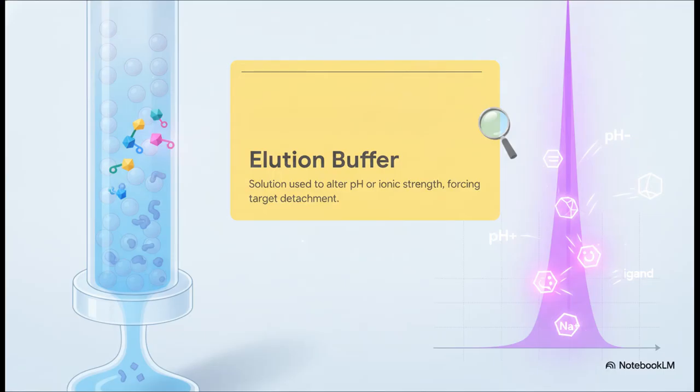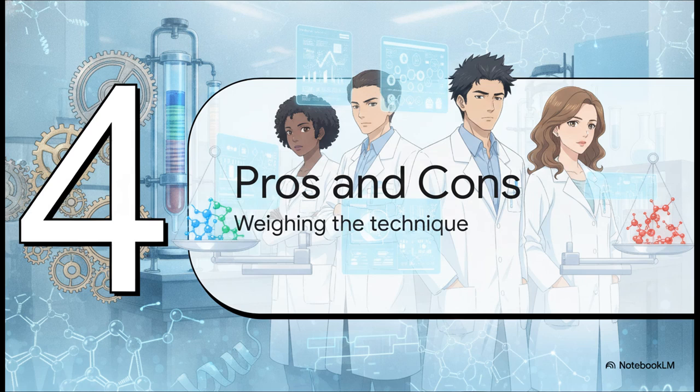To get that beautiful, sharp spike, we have to use an elution buffer. Because that biological interaction is so strong, once the impurities are gone, we actually have to chemically break that lock-in-key bond. We do this by changing the pH, altering the ionic strength, or sometimes adding a competing ligand to the mobile phase. This essentially forces the target molecule to let go of the stationary phase so we can finally collect it. Which brings us to Section 4, Advantages and Limitations.